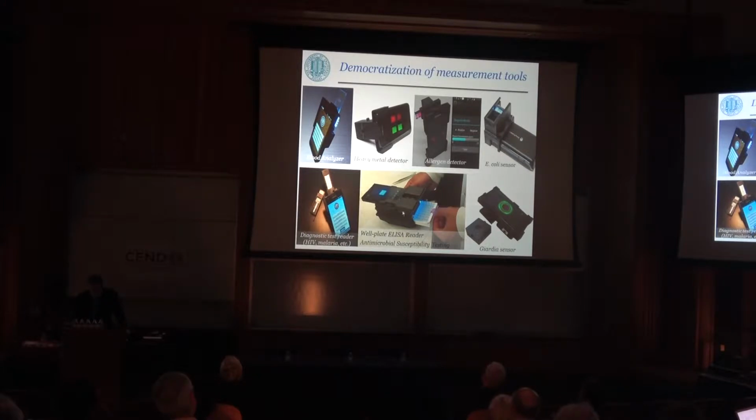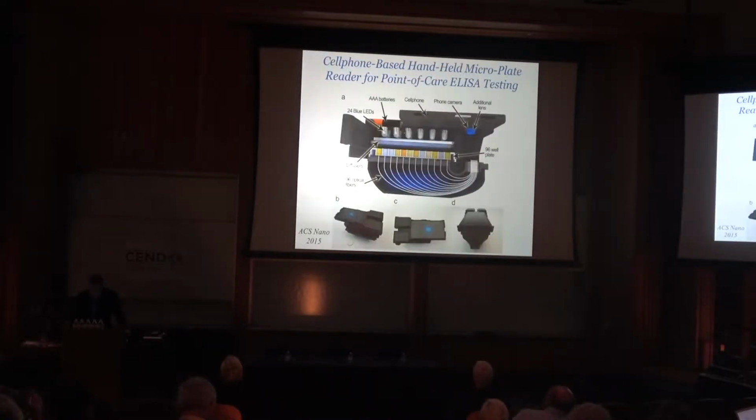This one is another very interesting device, which is a plate reader for various different applications for ELISA tests or other types of turbidity assays. You can utilize this smartphone-based reader for quantifying a standard 96-well plate in an easy, high-throughput manner.